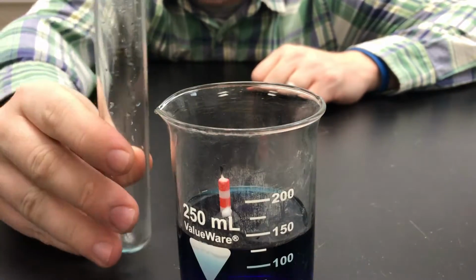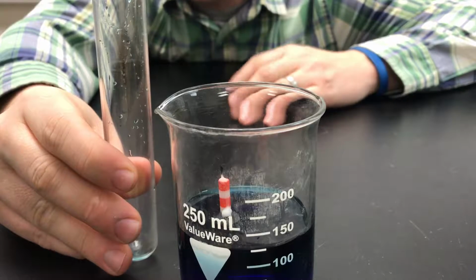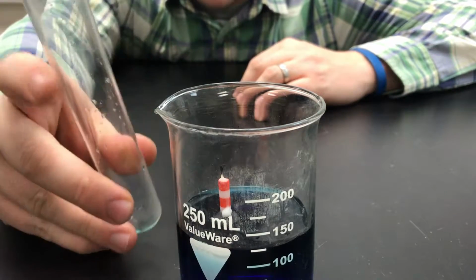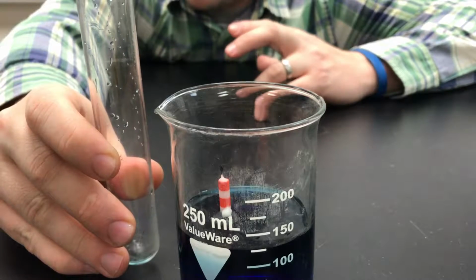This is Mr. Claus, and what I'm holding here is a test tube that's just filled with air. Now you know that air is a mix of oxygen and other gases. What we want to do is find out exactly what percentage of the air in this test tube is oxygen.